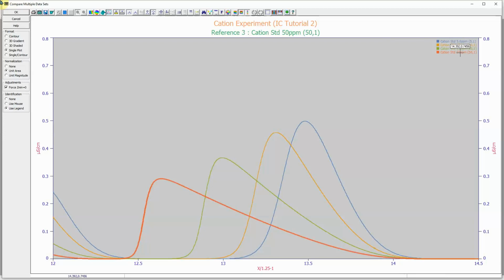And we'll note that any test of a chromatographic model should vary concentrations and include at least some portion of this nonlinear regime where the chromatographic fronting and tailing is visibly discernible.